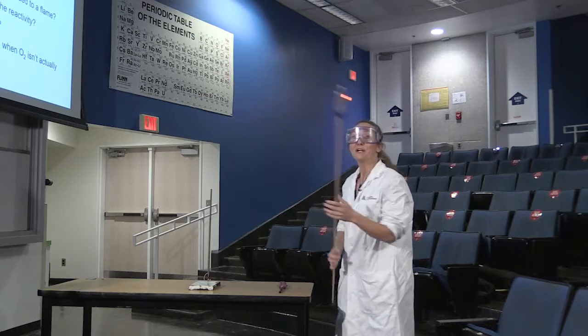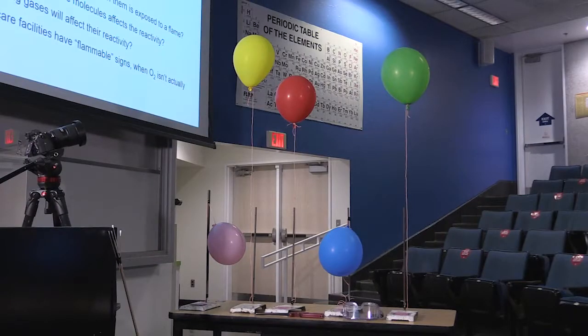Yep, very predictably, the noble gases are very, very unreactive, exactly like we would predict they are. So the electron configuration makes a huge difference in what's going to happen with a lot of these balloons. Now, the other thing I want you to think about, as I referred to at the beginning of this, is why some of these balloons float and some of them don't.